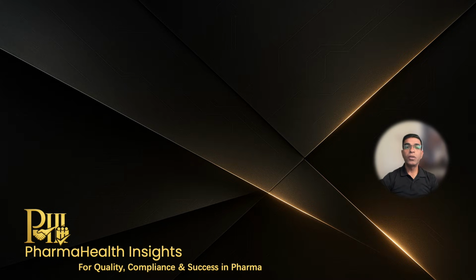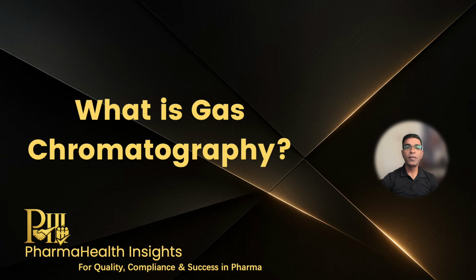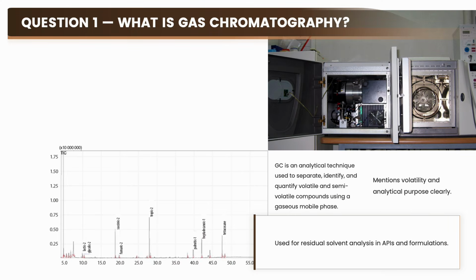Now the interviewer looks at your resume, sees GC mentioned there, and asks the very first question. What is gas chromatography? At this point, don't rush your answer. You should answer like this. Gas chromatography is an analytical technique used to separate, identify, and quantify volatile and semi-volatile compounds, where the mobile phase is a gas. This answer works because you clearly mention the word volatile, which is the backbone of GC. When you also connect it with pharmaceutical residual solvent analysis, the interviewer immediately understands that you know where GC is used practically.